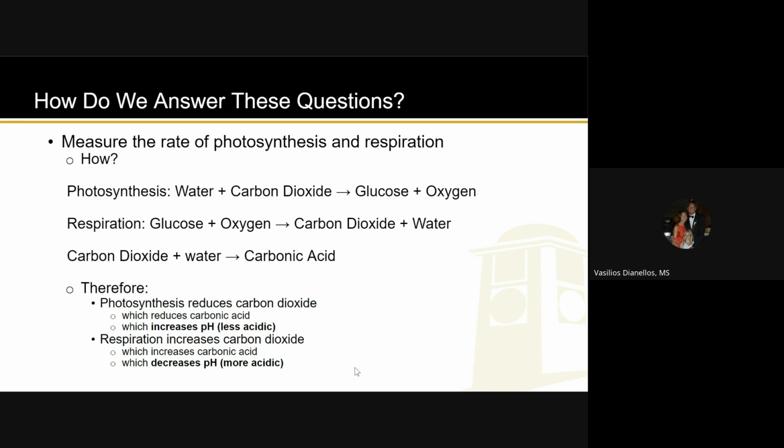First of all, again, like I said previously up here, the thing you're using to measure the pH doesn't go all the way down, right? So there's a point where the pH might still be decreasing, but you have no way of knowing it because you can't measure below a certain point.